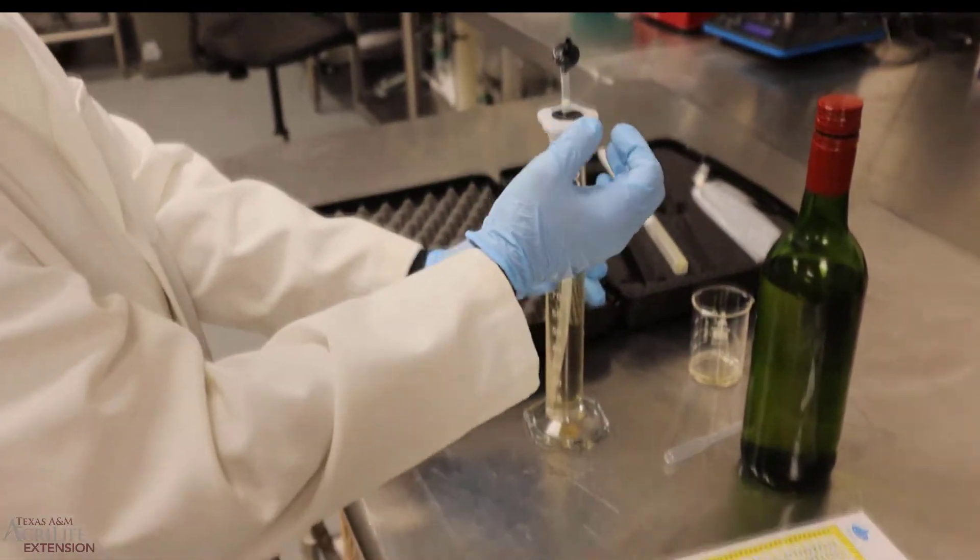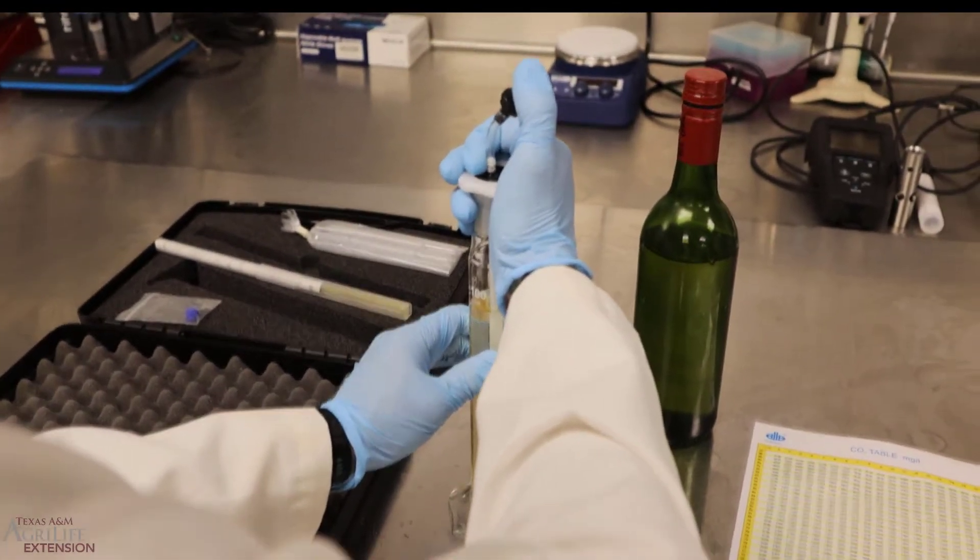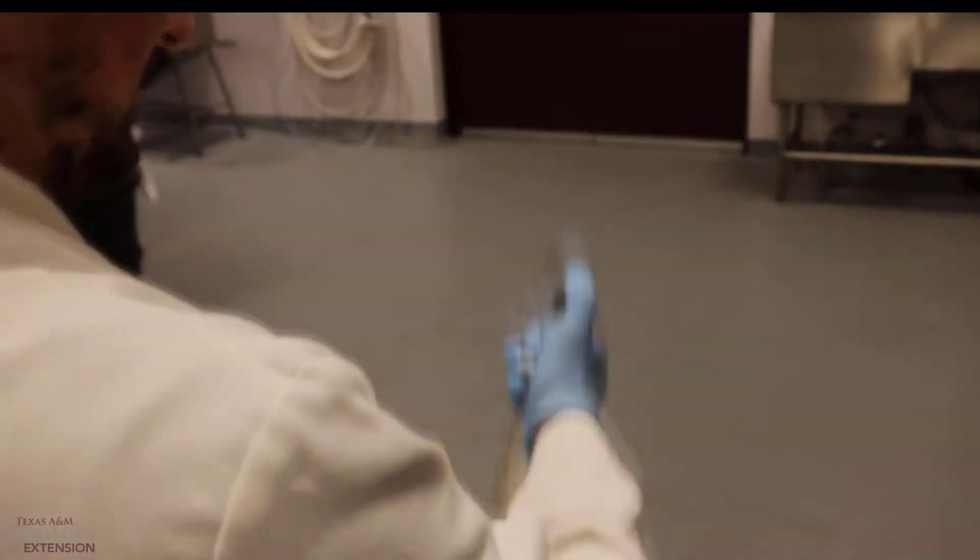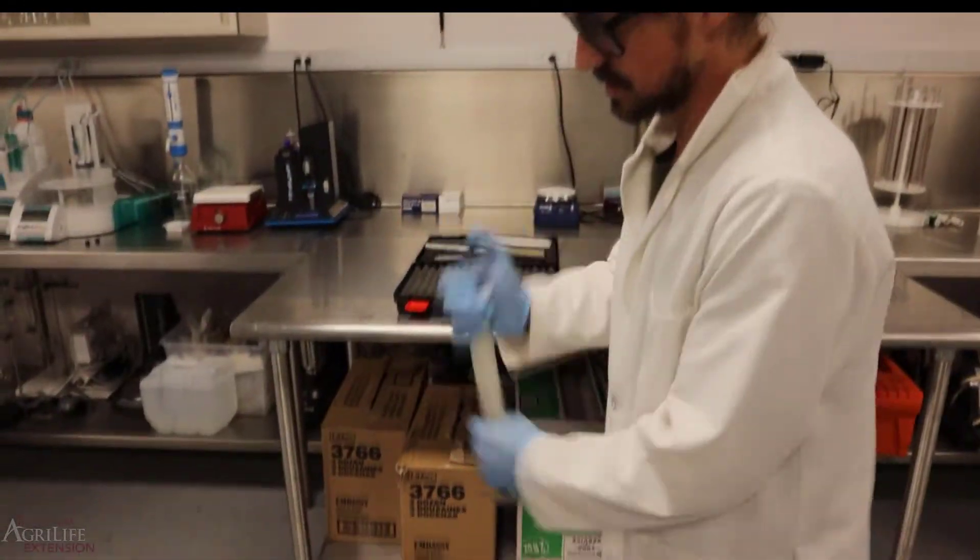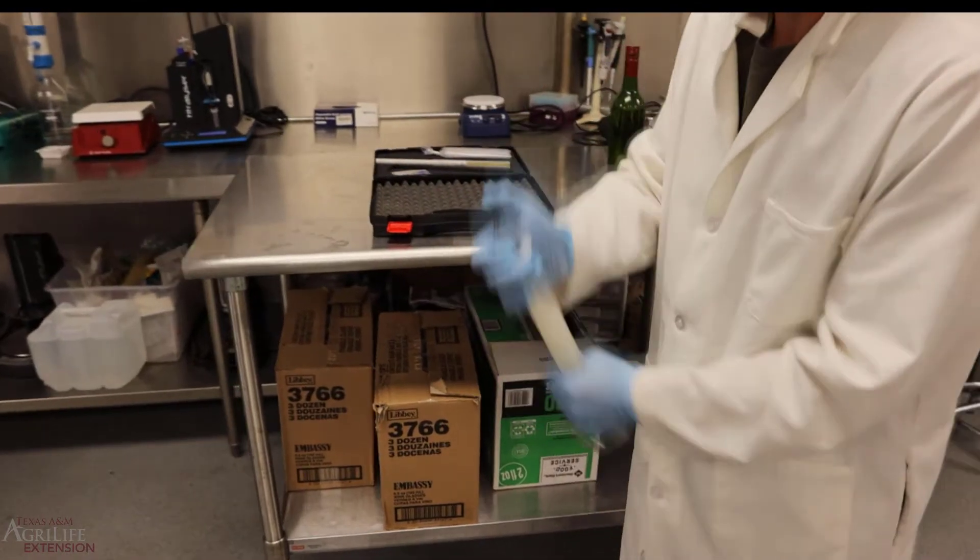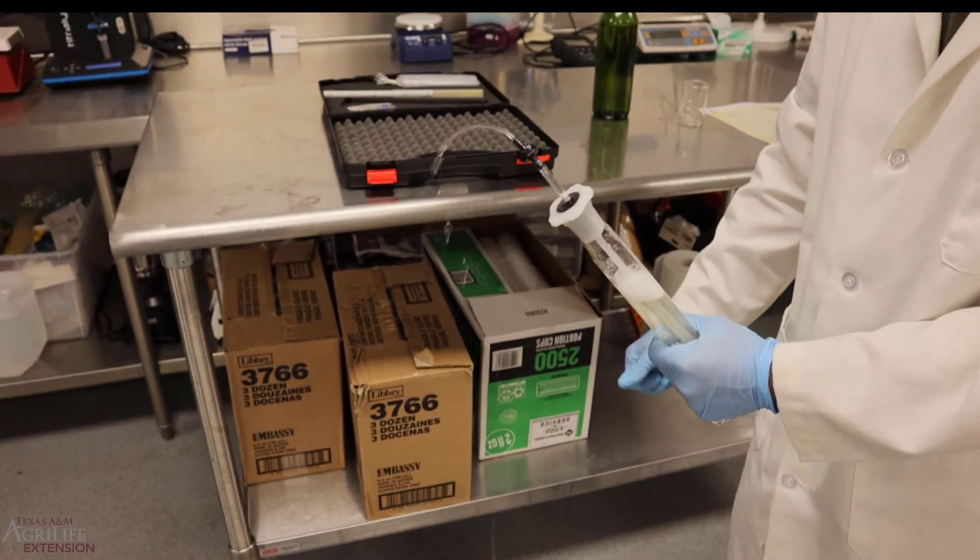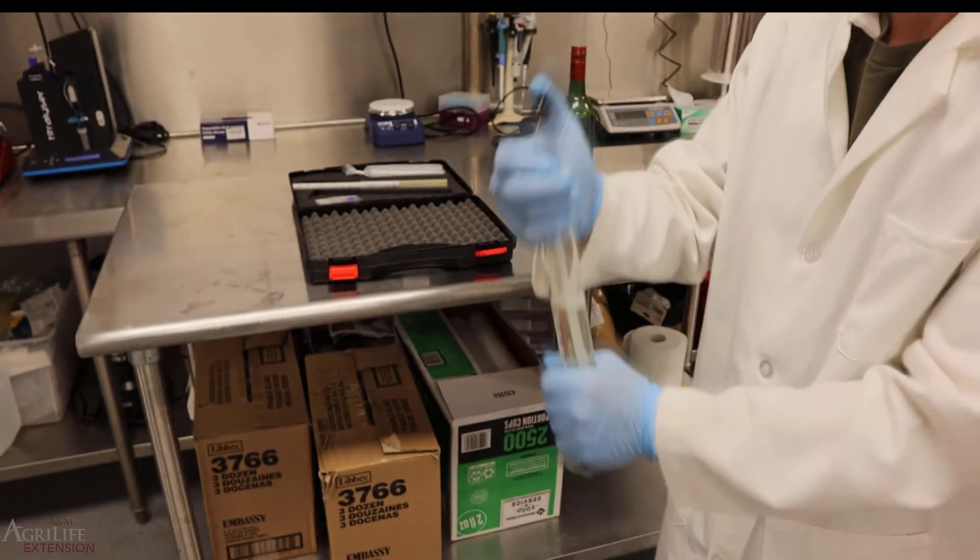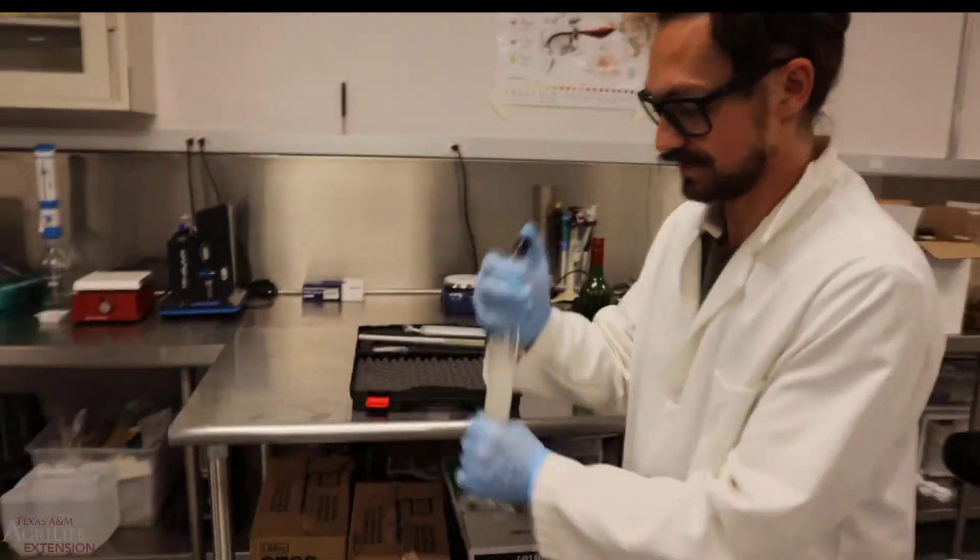We'll put our finger over this hole right here on the top. And then we will shake this real quick. Doing this we'll remove our finger from over the hole. And we'll see wine released. We will continue to do this until there's no more flow of wine out of the cylinder.